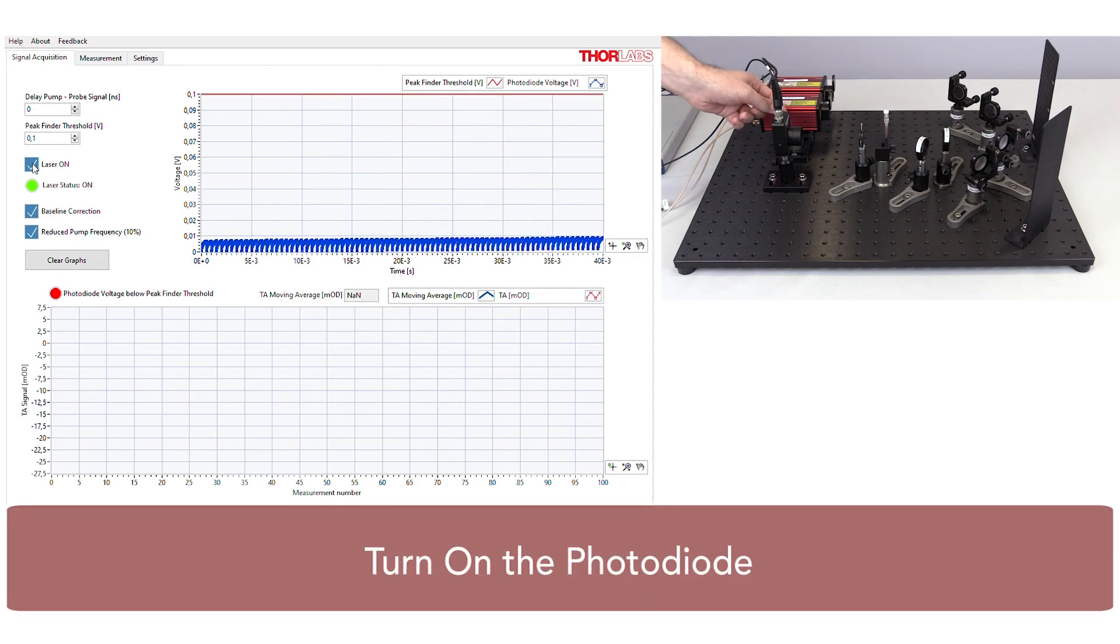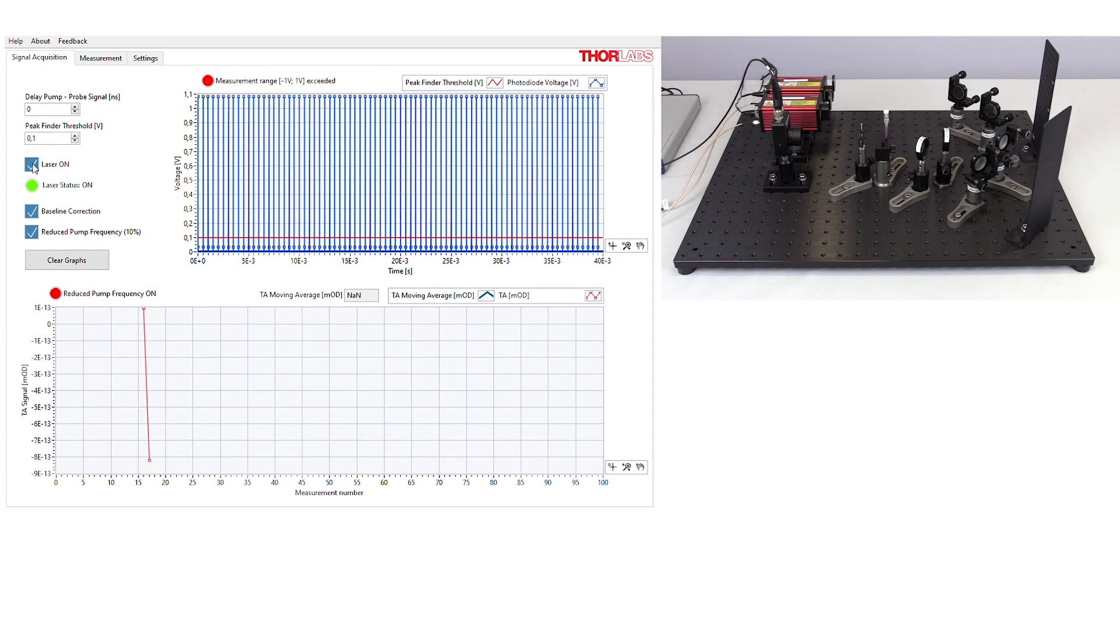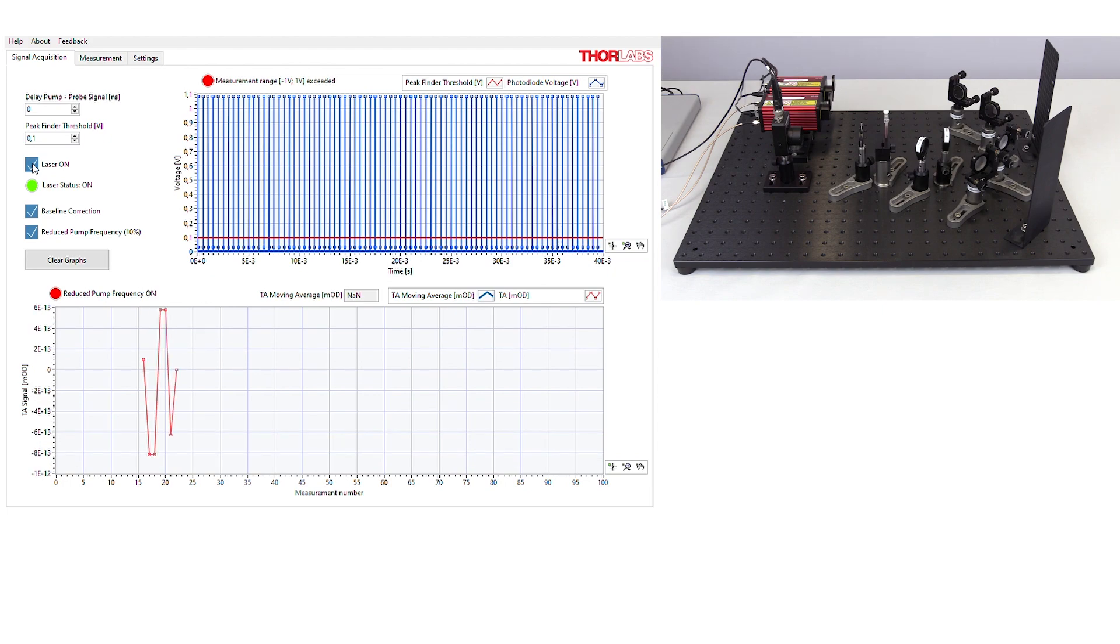Now, turn on the photodiode. The power status LED on the side of the housing should appear green. Note that the photodiode gain setting should already be set to 10 decibels.